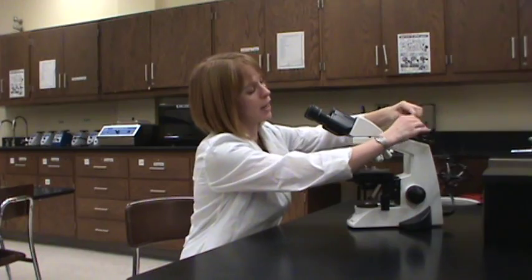When you get your microscope, you're going to place it down on the bench, take out the cord, and go ahead and plug it in. There is an on-off switch back here. Once you turn it on, see that you have light.